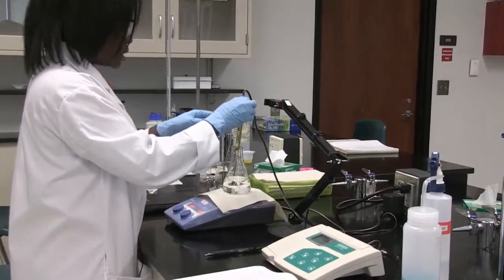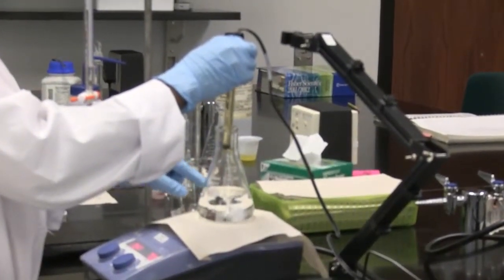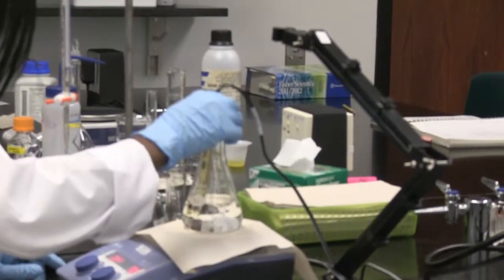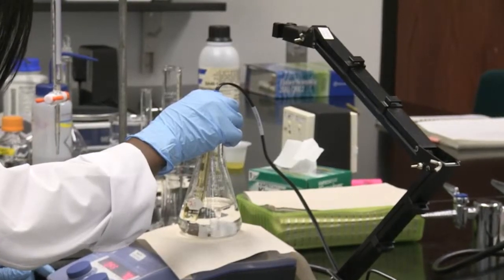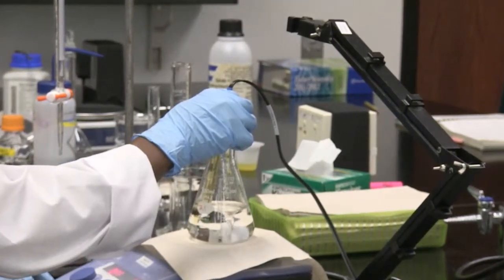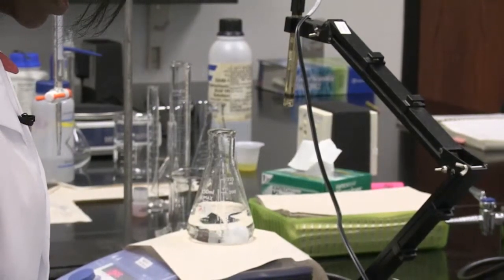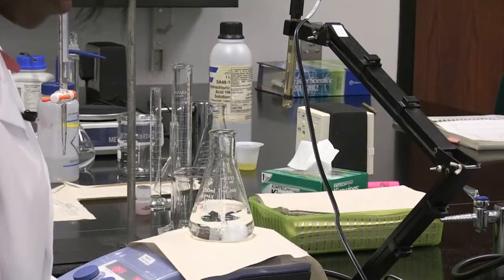To measure the pH correctly while the solution is mixing, I detach the electrode from the pH meter stand and immerse it enough into the buffer, making sure it is not in the path of the stir bar. The pH reading is 4.74, so I document that initial pH of the buffer as 4.74.